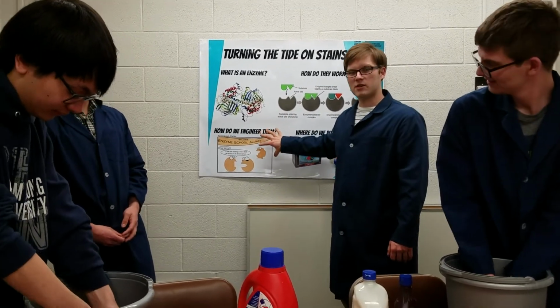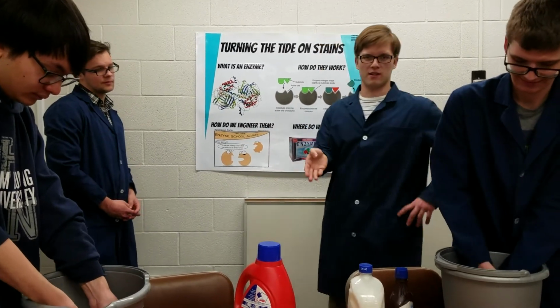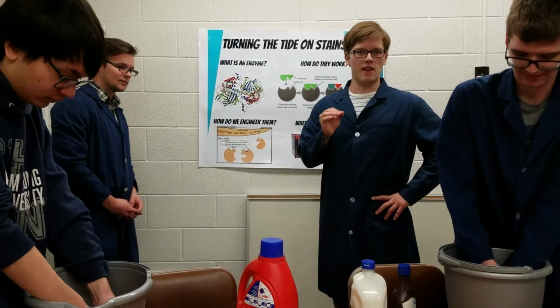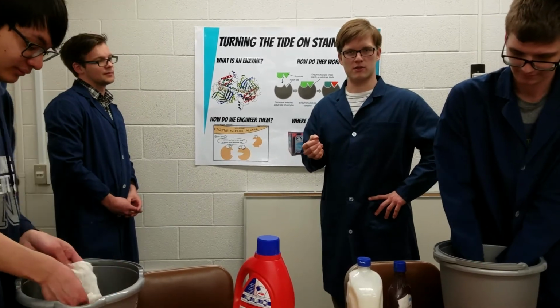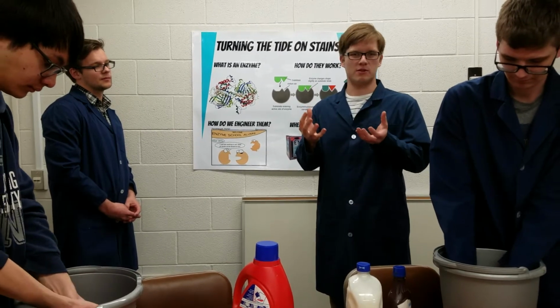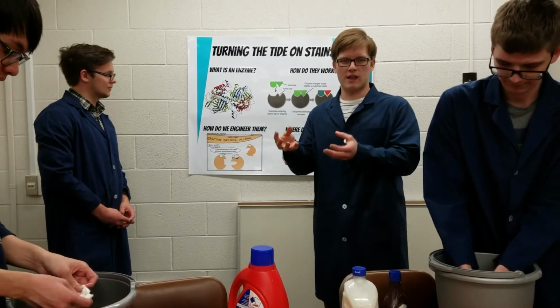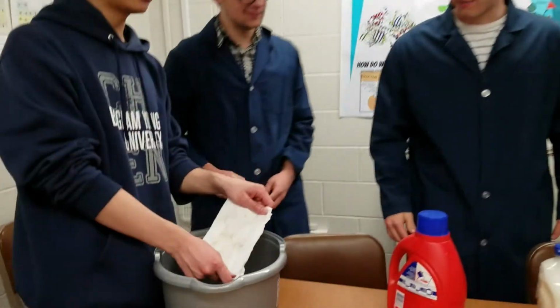One question to ask is why this would be important when you're putting enzymes in laundry detergent. It's key that you mention that temperature affects the denaturing of enzymes, so that your students can make the connection that the temperature of the laundry could affect the enzymes in the laundry detergent. Now let's see how those stains turned out.